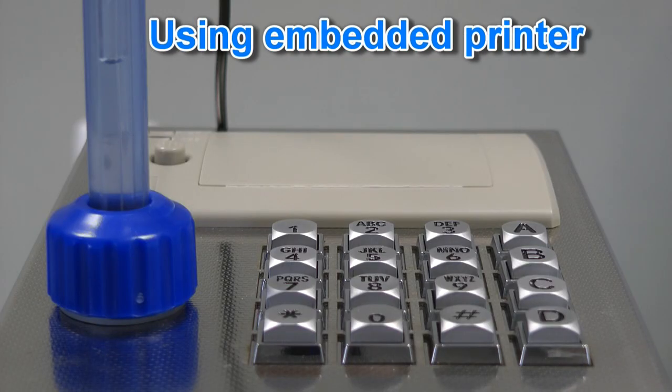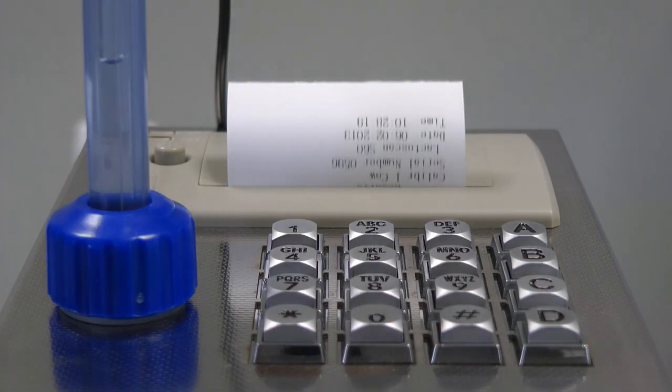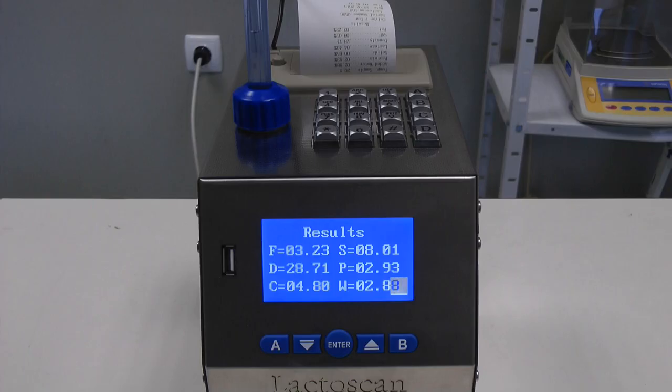The analyzer has an embedded print option. The results will be automatically printed when the measurement is finished. To reprint the results, press button A.